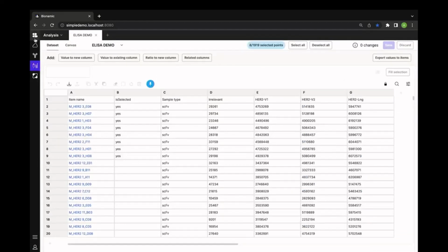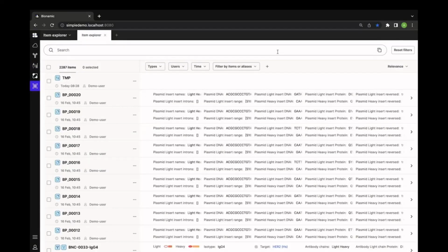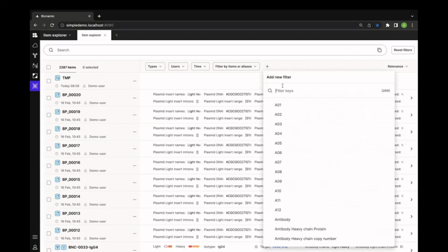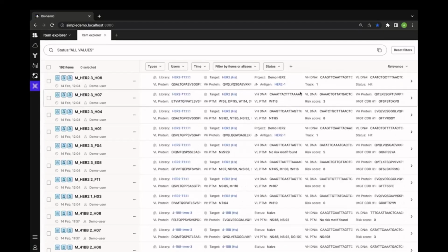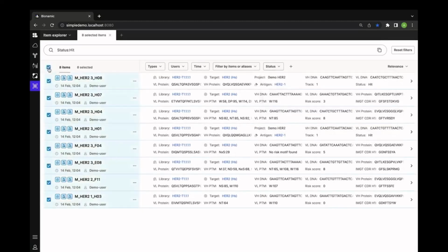But the nice thing is, by doing that, I can at any time, anywhere, just filter these out by looking for my status and hit criteria. So here are my eight hits.